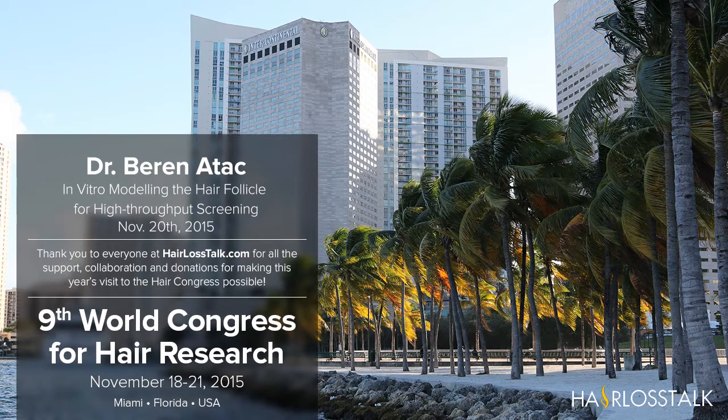Yesterday Bruce talked about, and today Pantelis talked about, the importance of DP. We also concentrated on the presence of DP and its crosstalk with the epithelial tissue of the hair follicle. So this is the first point we have to take into account: how to make these cells talk to each other, how to make them communicate.